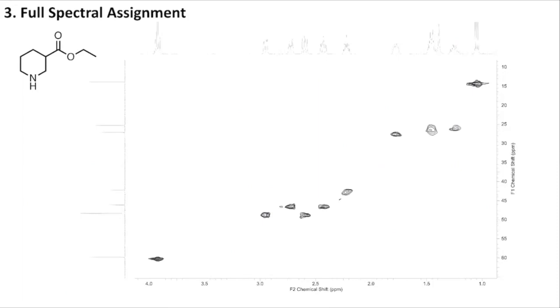Here is our HSQC data. Again, before we get into these correlation signals, let's go ahead and put our assignments back up on our 1D spectra. When we go to start labeling these carbons, make sure you're taking account of the chemical shift range. We're not going all the way up to 170, so this is not carbon 1 here, this is carbon 2. We're skipping 1 because that is a carbonyl carbon that is quaternary. It will have no hydrogens on it based on our knowledge of this structure. And then same as before, let's draw lines down and across to find our correlations.